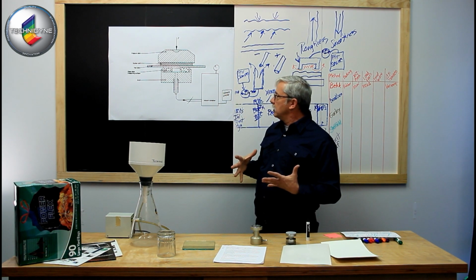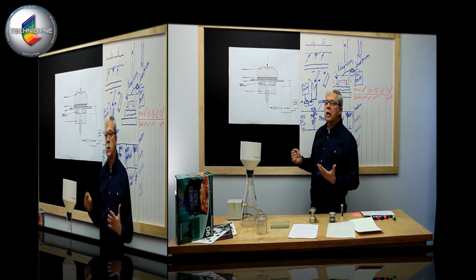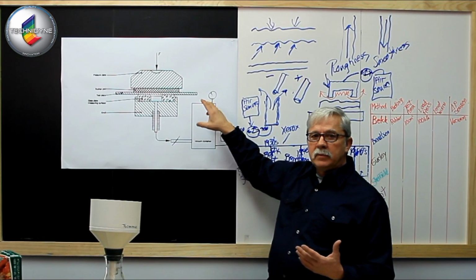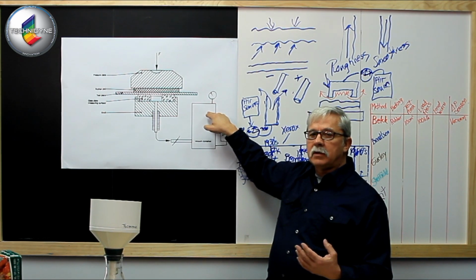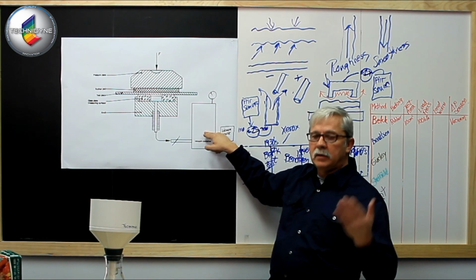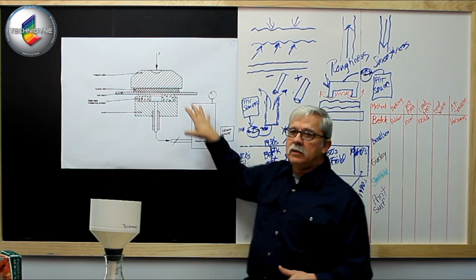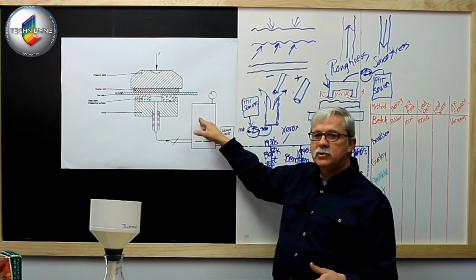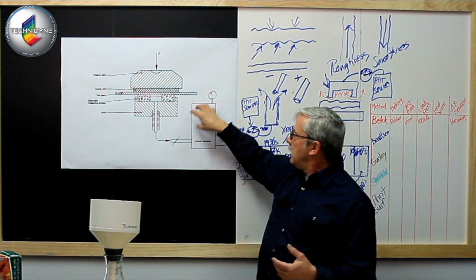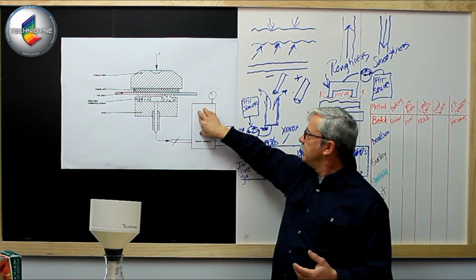Now that's good. But in order to come up with a rate, I need to time that period from my initial negative pressure until I reach my lower level of negative pressure that I have calculated to bring in 10 milliliters of air into my chamber. So I evacuate this to my fixed negative pressure.